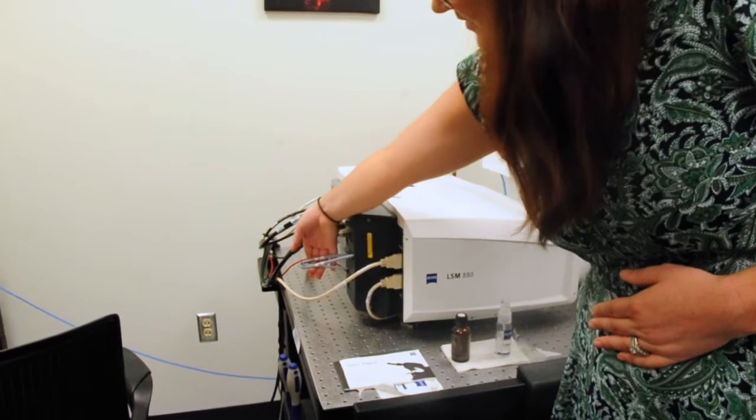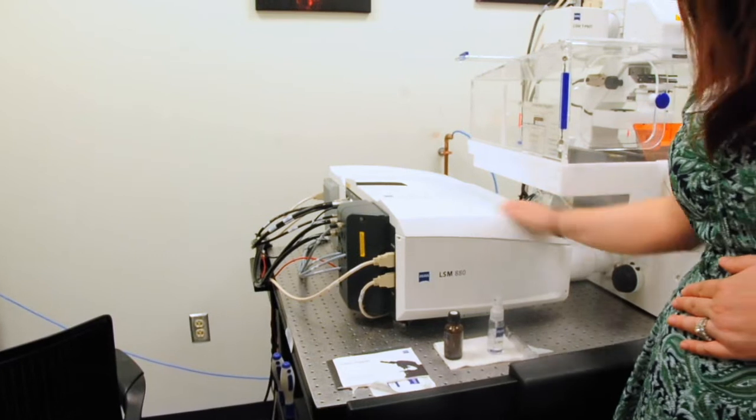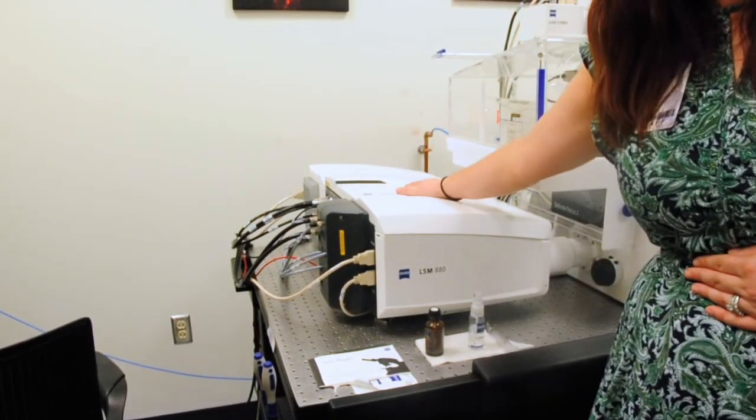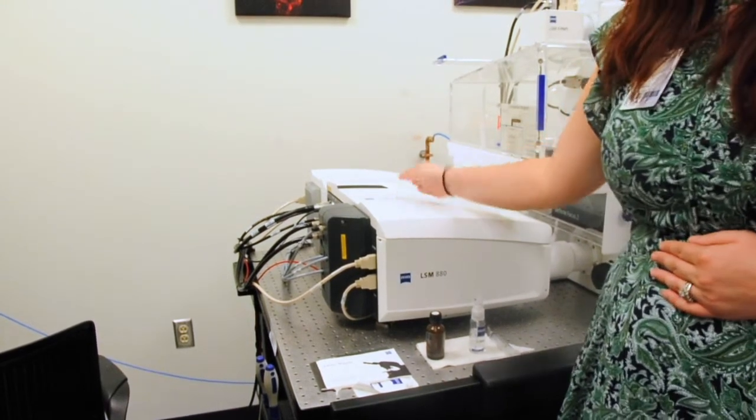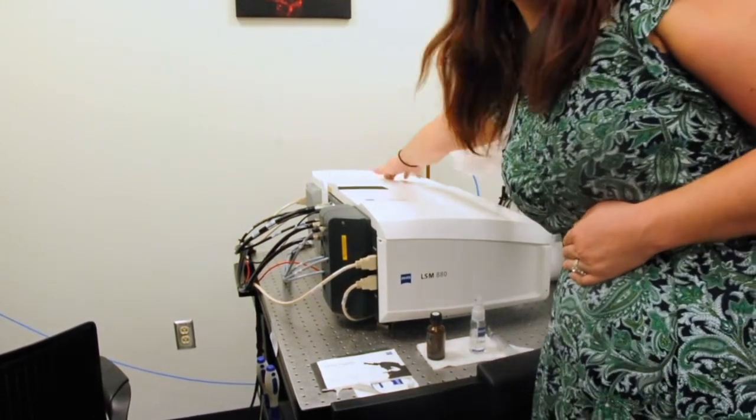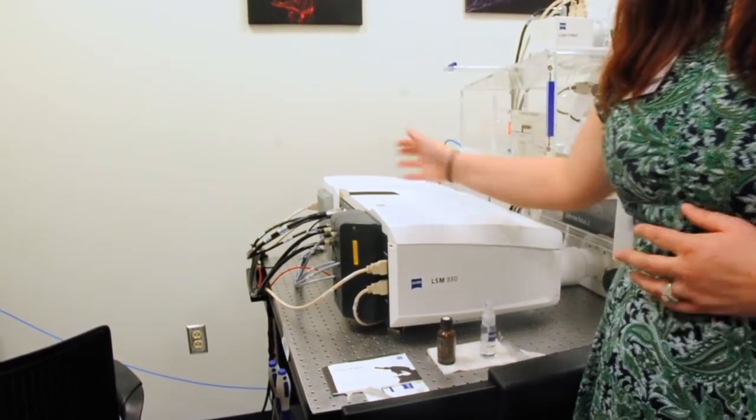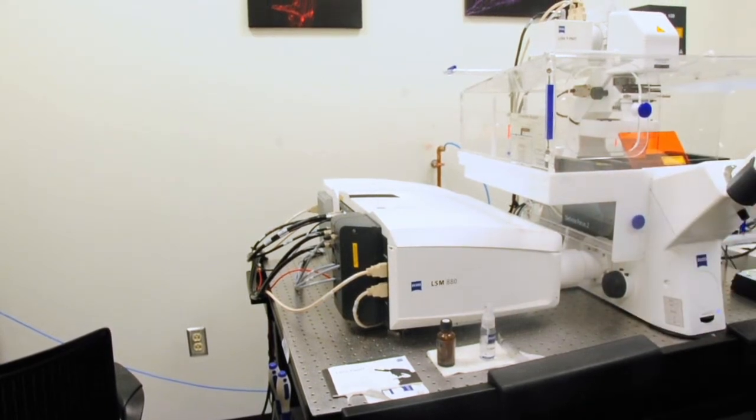Our lasers actually are coming in right through here with our optics coming into the scan pad, going to our sample, coming back and being dispersed with variable dichroic mirrors to the different PMTs. Or we can have it bypass that and go all the way back to the Airscan, which is a 32 hexagonal array that allows us to have a better resolution than we would normally have with a confocal microscope.